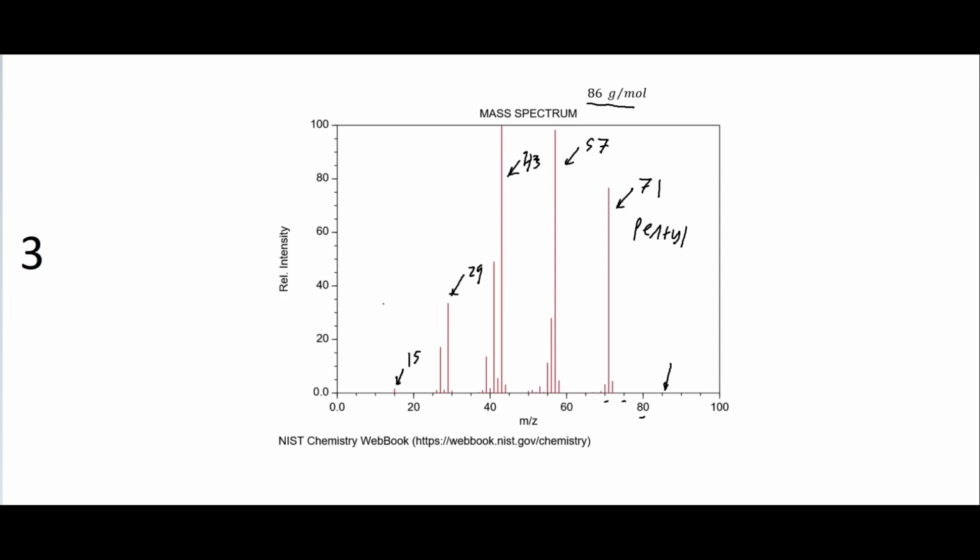And so we can maybe think about, so we want to have a stable propyl group and a stable butyl group here. And so it looks like we have a stable butyl group, which is likely going to have the positive ion there rather than on one of the primary carbons, and a stable propyl group, which will look like this.